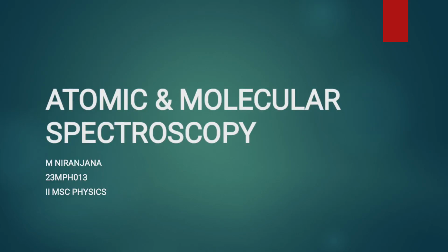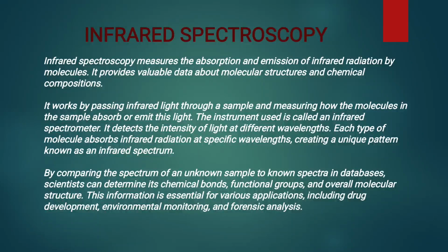I'm going to explain about infrared spectroscopy. Infrared spectroscopy measures the absorption and emission of infrared radiation by molecules. It provides valuable data about molecular structures and chemical compositions.